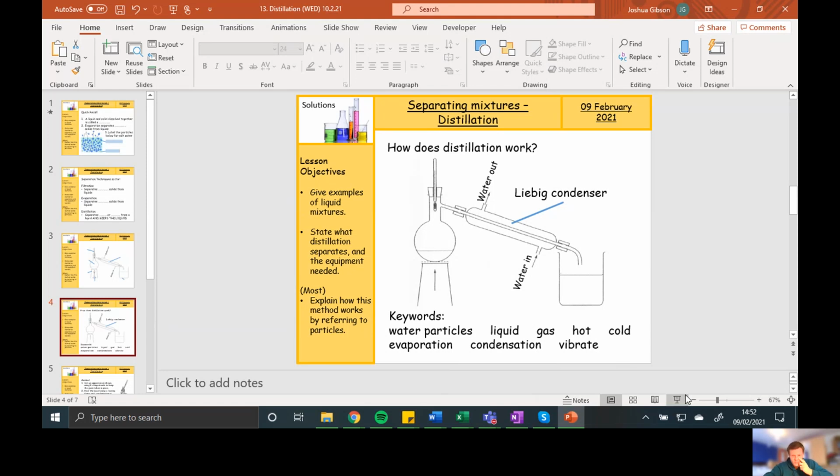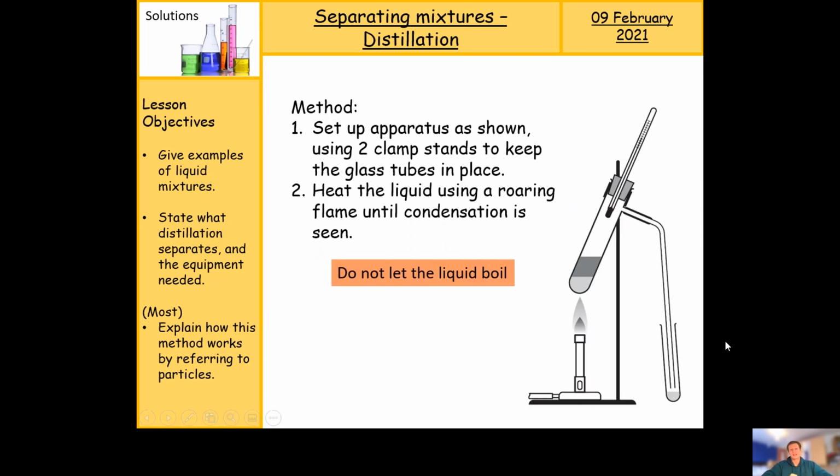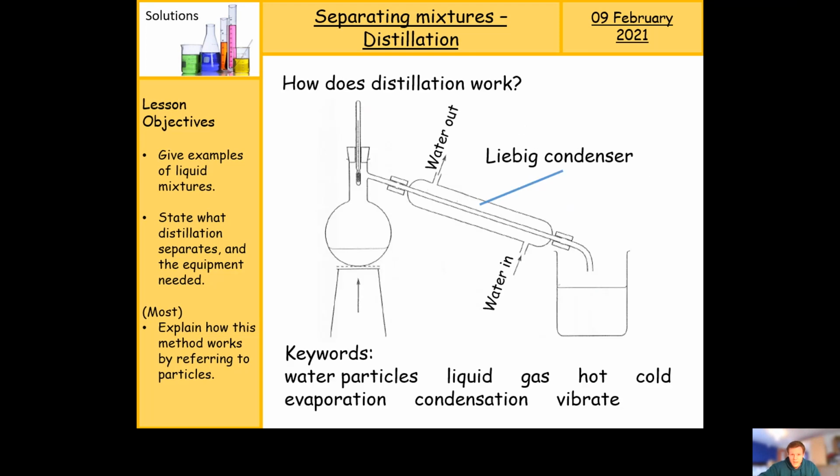Okay, so now that you've sent me the summary, we can move on to the next step. So the next step is to show you the slightly disappointing version. Okay, so Liebig condensers, these ones over here, they are very expensive. They're made of glass and they're very delicate. So normally we do not trust handing out loads of them to people because they're quite expensive.